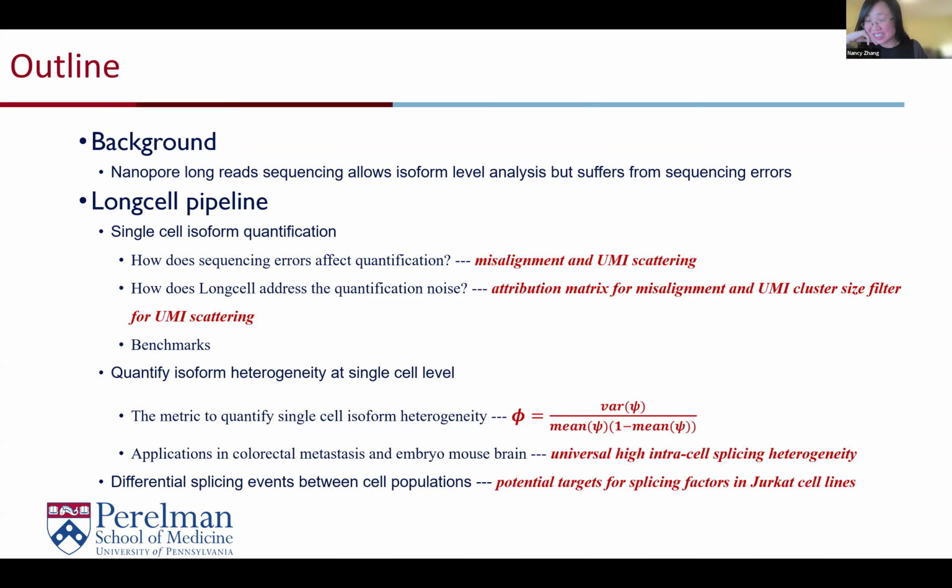Yeah, I think that's a good idea, to look at the distribution of this phi, where high phi is high intercell, low phi is high intracell, and look at how this varies across pathways and across regulators. Maybe for your future project; I mean, in this paper you already have very comprehensive results. Yeah, I think the data has become better since we published this paper, so there are a lot more opportunities now with the data being generated compared to when we were doing this paper.